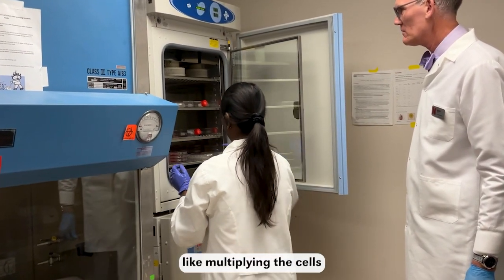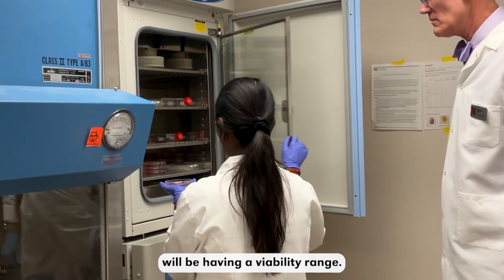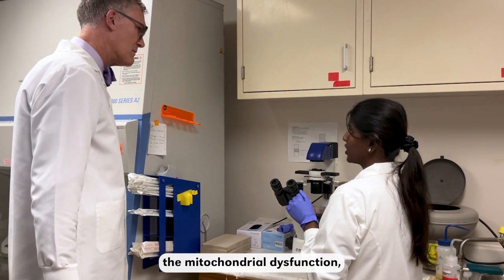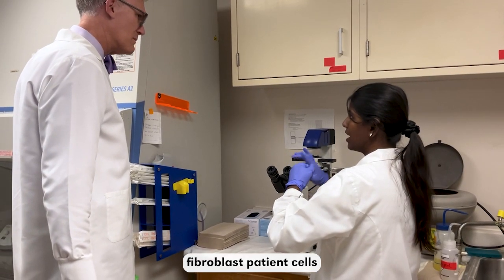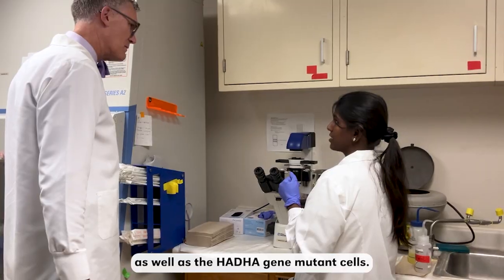Culturing is like multiplying the cells so that every cell line will have a viability range. Since I'm working on the fatty acid oxidation disorder and then to see the mitochondrial dysfunction, I will be working with the fibroblast cells. That means the control fibroblast patient cells as well as the HADHA gene mutant cells.